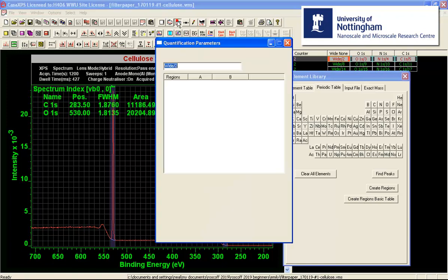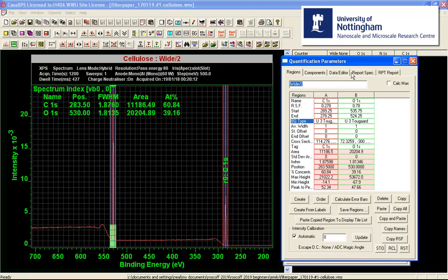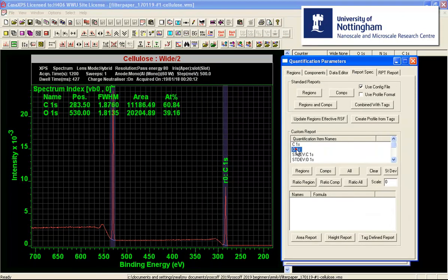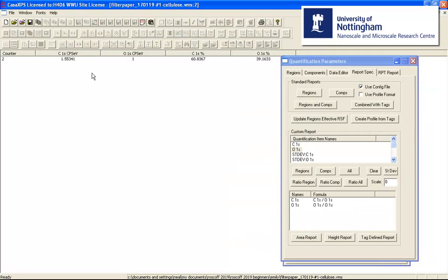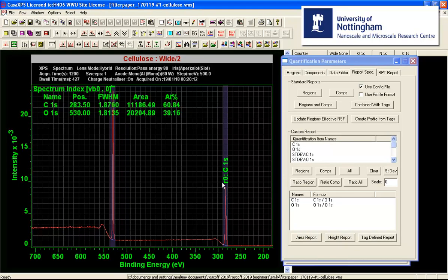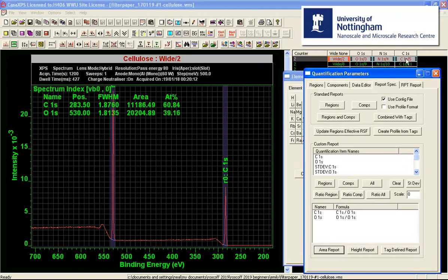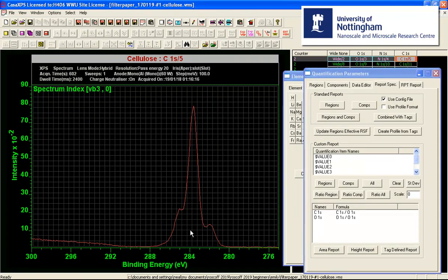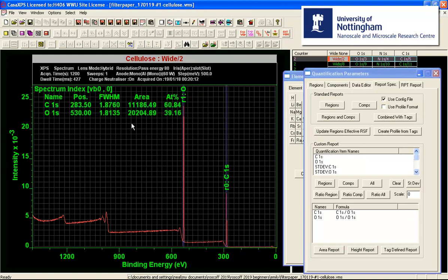For cellulose, we would expect a carbon-to-oxygen ratio of about 1.2. Looking at the ratio of these regions, we get 1.55, which suggests slightly more carbon than expected for cellulose. Looking at the carbon 1s spectrum, you can see why — there ought to be two peaks for cellulose, but there is additional carbon signal associated with CH that should not be part of cellulose. This explains why the survey spectrum indicates more carbon than the expected amount relative to oxygen.